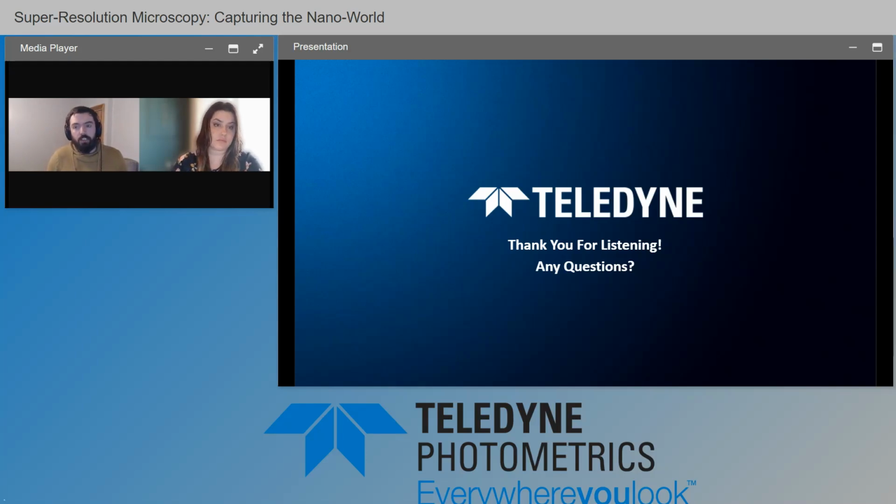The same with the rest of the techniques. Because you need contrast in order to benefit from the higher resolution capabilities of your system, they're often exclusively used with fluorescence, especially with things like GFP, and you can treat your samples and add fluorophores. Some only work with certain fluorophores, like STORM and PALM. So yeah, the technology is very compatible with fluorescence.